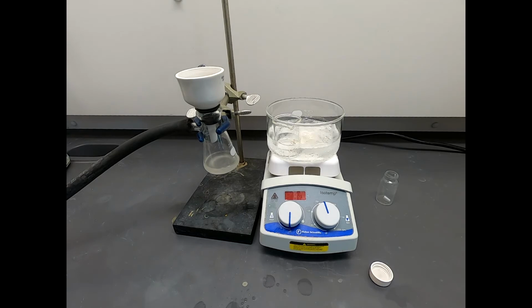Now we need to let this dry. I'm going to let this stand on this sidearm flask for a little bit. And then we'll put it out on a weighing paper, and we'll see how much solid we collected.